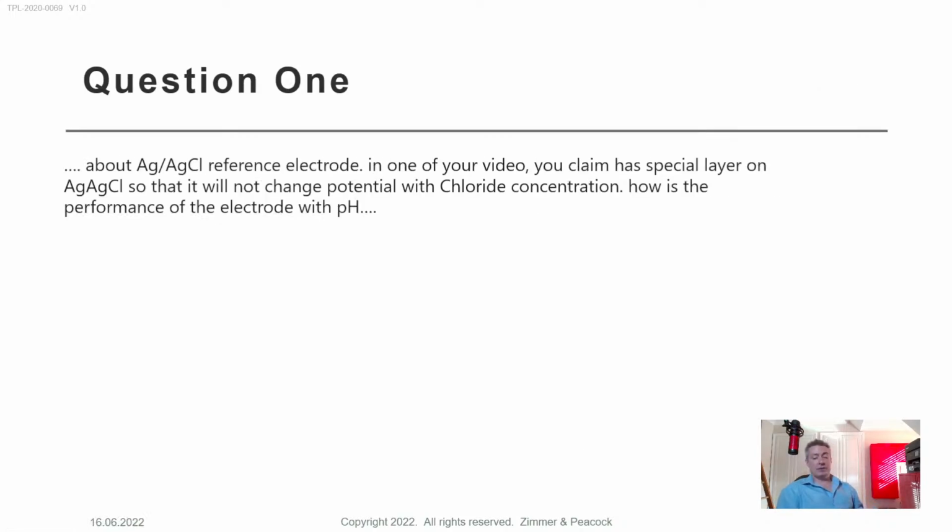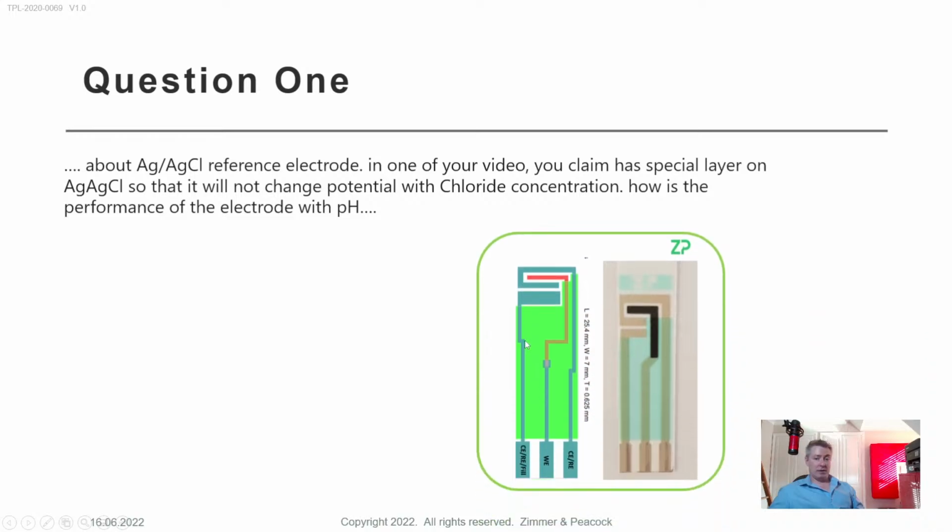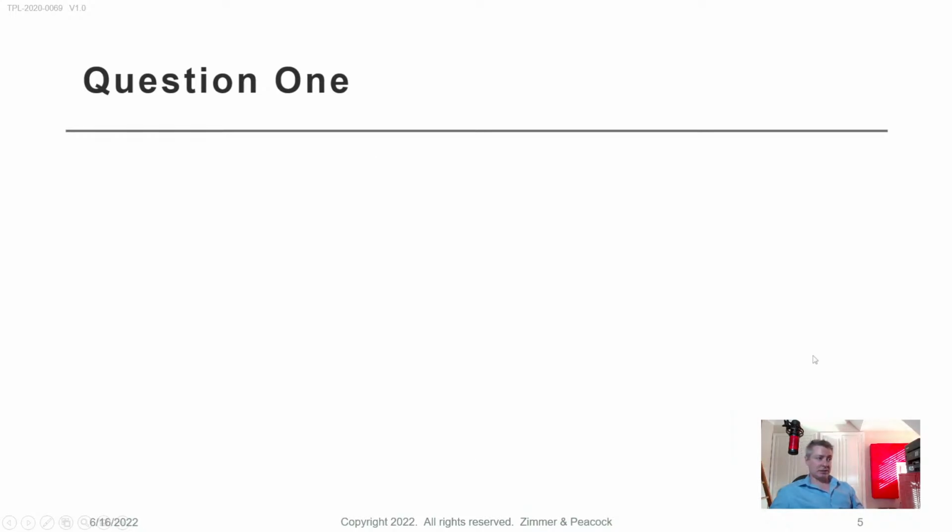So the first one is, it's nice that people are following the videos online, and the question was, we know you can make a chloride resilient electrode, but is it pH sensitive? So I will jump into that now. On many of our electrodes, you'll know that we have a silver chloride electrode, and that is meant to be stable, but it's only stable if the chloride is stable. We can then put this resilient layer on it, and then the question is, is silver chloride intrinsically pH sensitive?